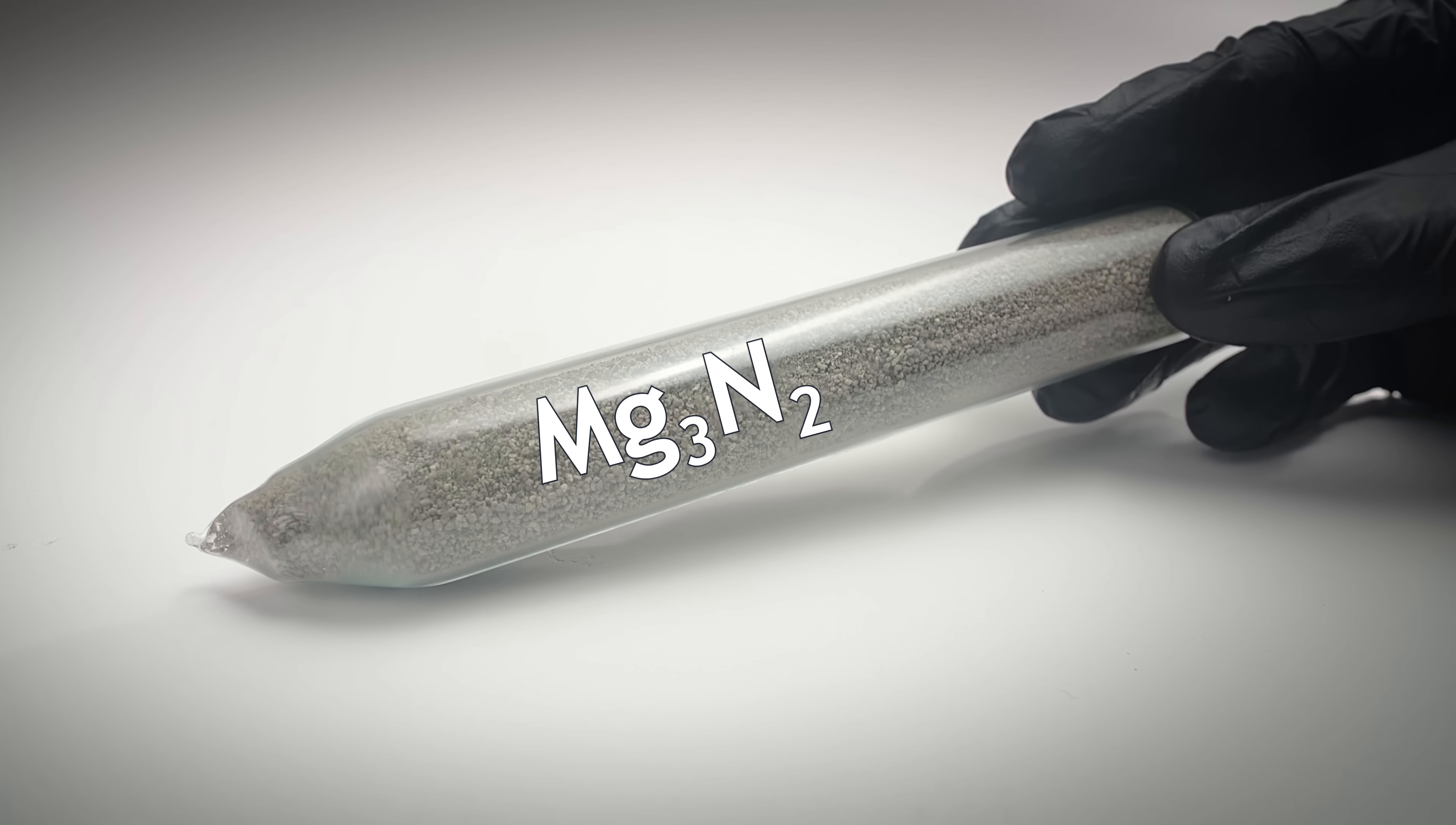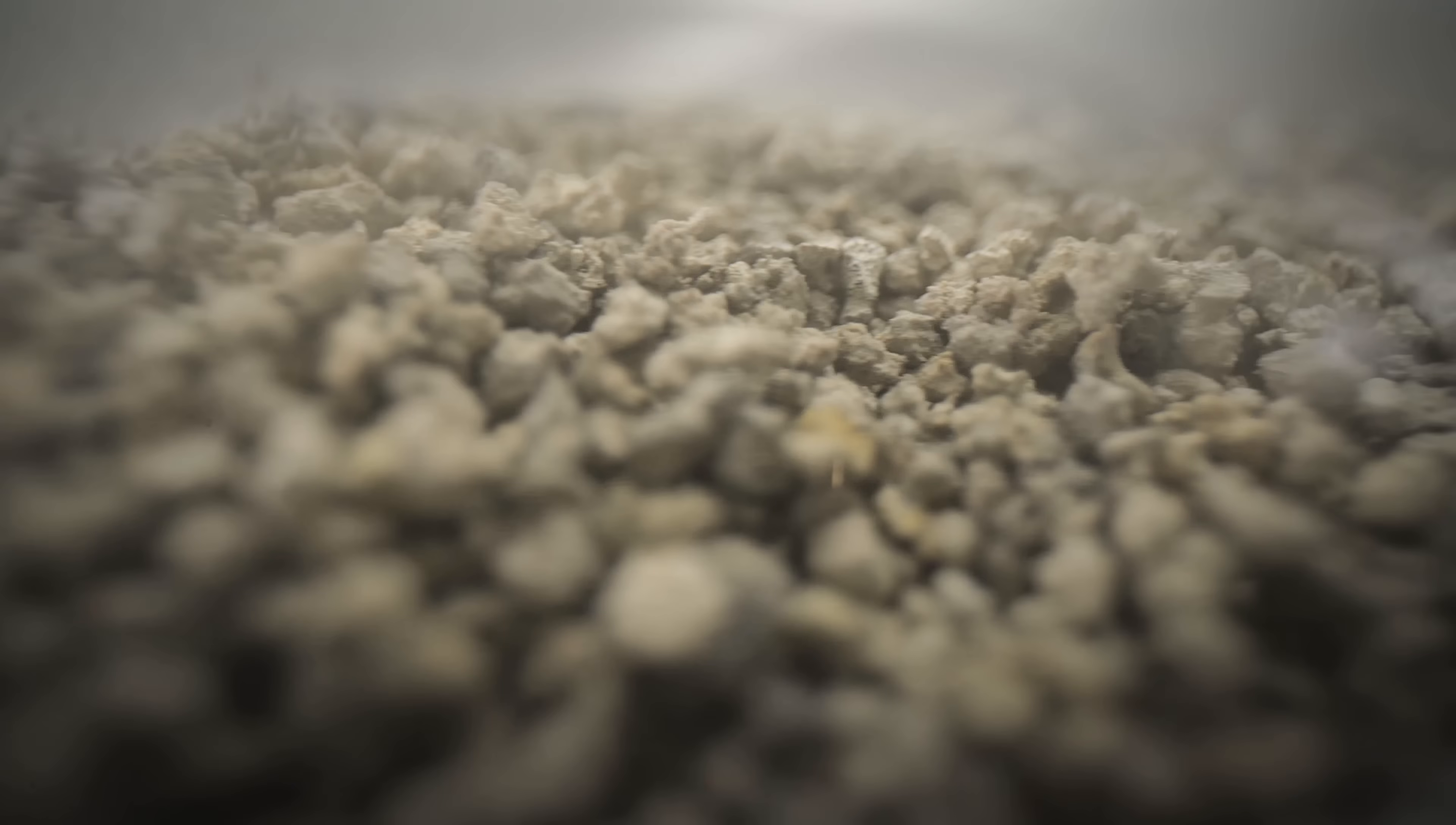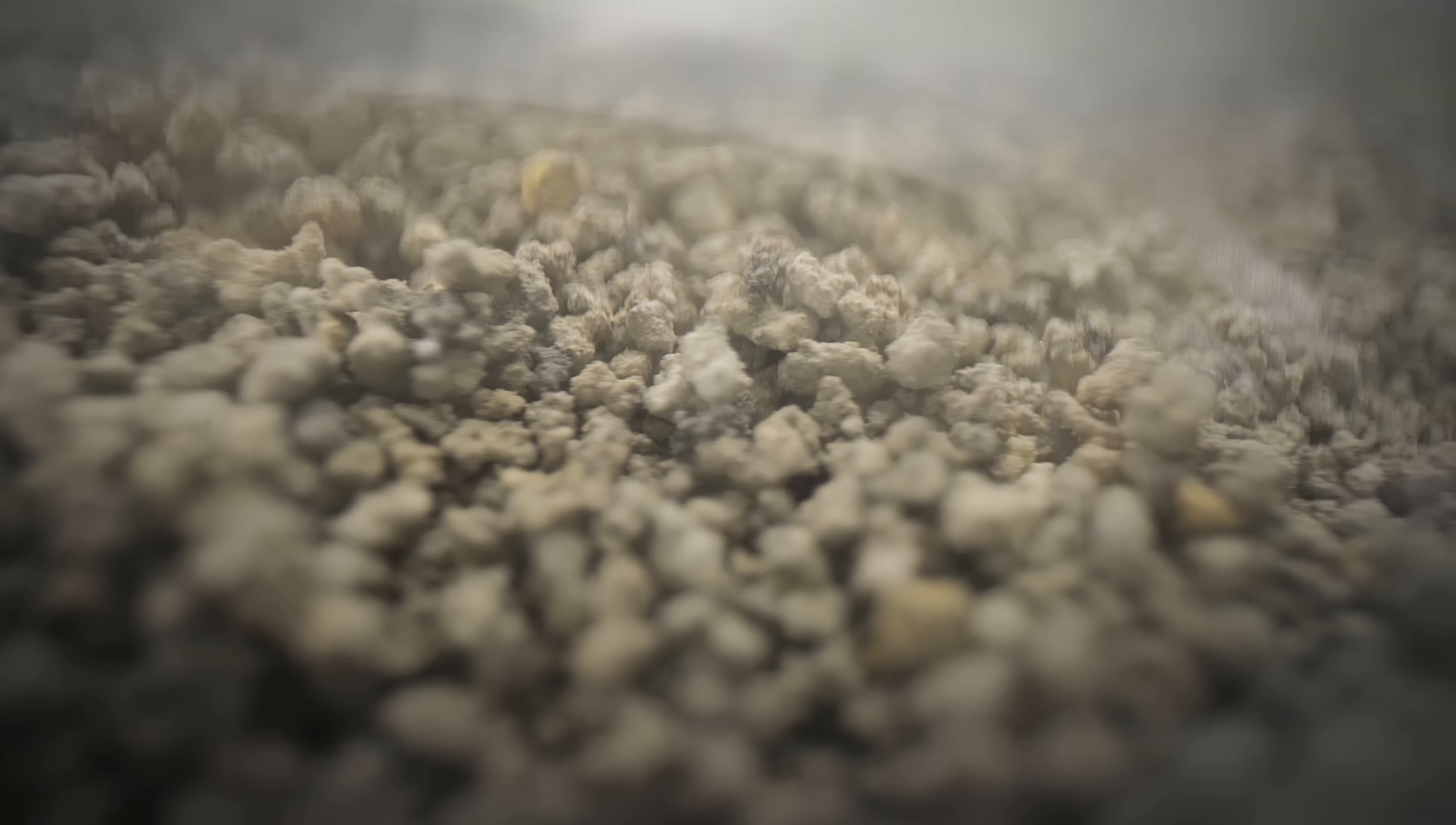Because of its reactivity with moist air, magnesium nitride is best stored in a sealed ampoule like this one. Magnesium nitride is a yellow-brown powder that actively releases ammonia in moist air.